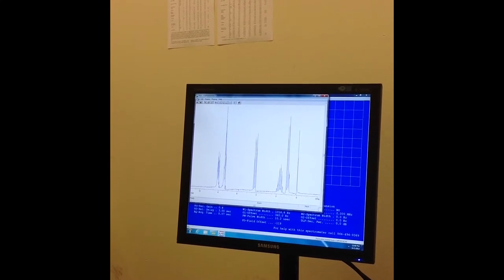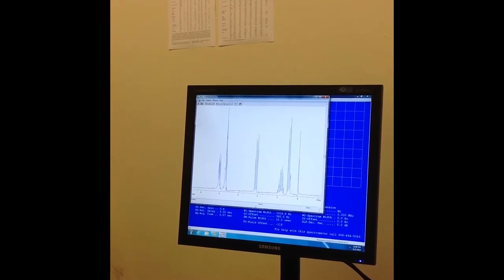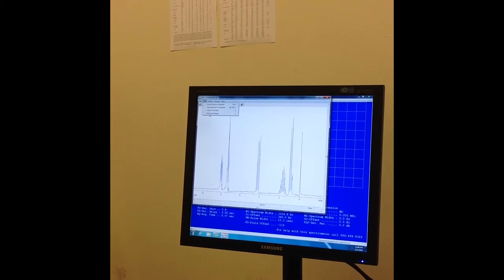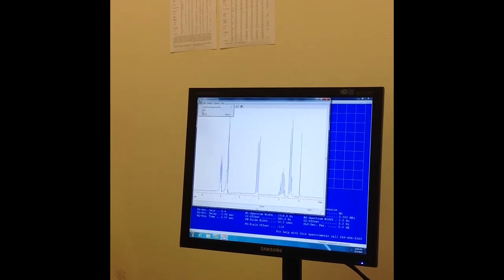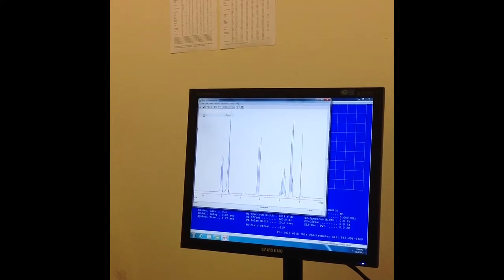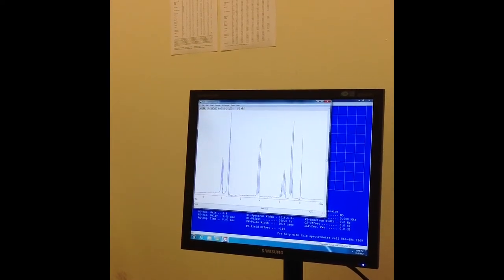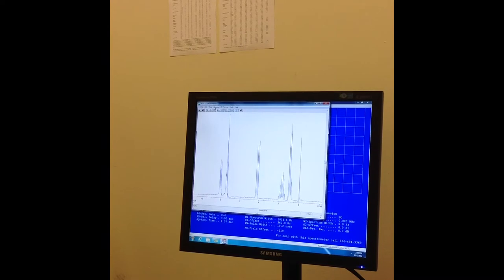To exit out of ZO, make sure you do this, you have to go under File, and then Exit ZO. Now you're out of the zoom function, and now you can go under Process.